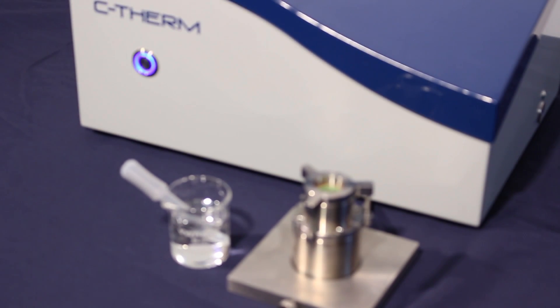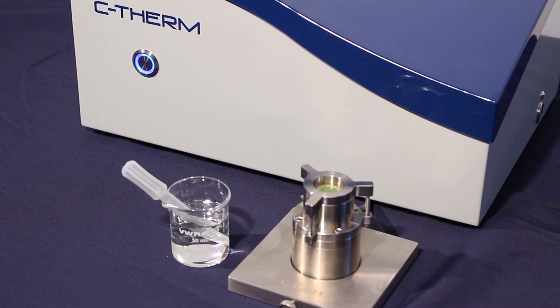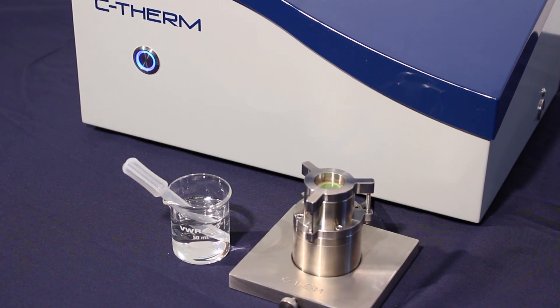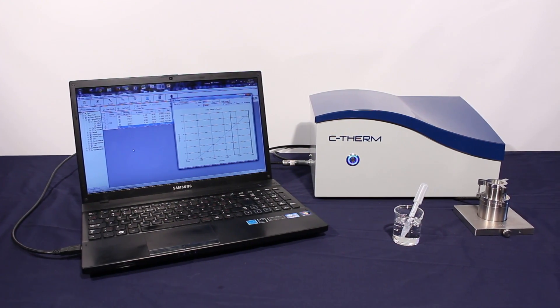Today this is Jay with C-Therm Technologies and today we're going to take a look at measuring the thermal conductivity of distilled water with the TCI thermal conductivity analyzer.